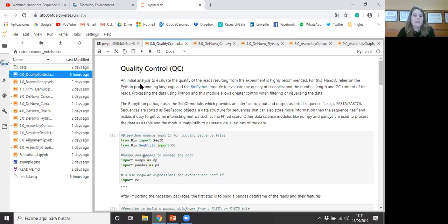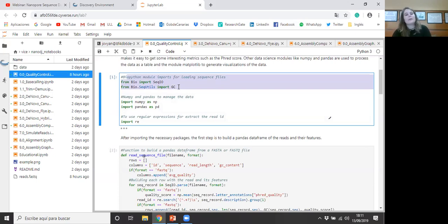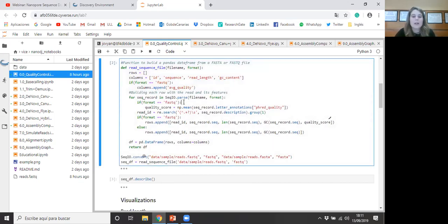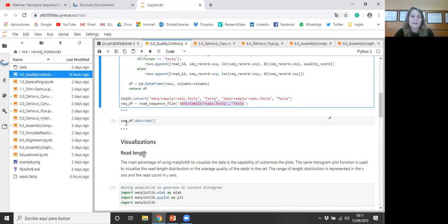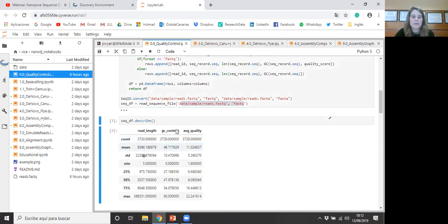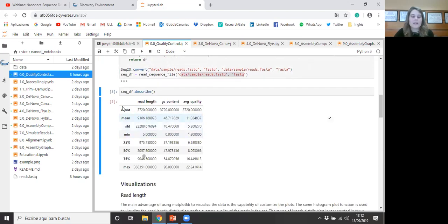A quality control step of your reads is highly recommended. For this, NanoDJ relies on the Python programming language and the BioPython module to evaluate the quality of the base call, the read length, the GC content, and the quality of your reads. Using this programming language and this module allows greater control when filtering or visualizing the data. In this part, we need to import all the libraries and packages necessary to manage the data and the FASTQ file. With this command, we are going to build a data frame with the ID, sequence, read length, GC content, and quality information — and in this part you can provide your FASTQ input file. Then here we can obtain basic statistic metrics of these parameters — read length, GC content, and quality — including the number of reads, the mean, minimum, maximum, and other basic statistics. This is very useful and gives you an idea of how the sequencing run went.